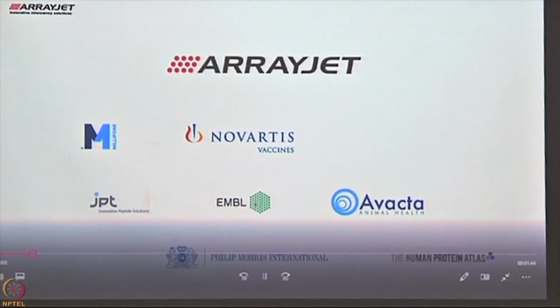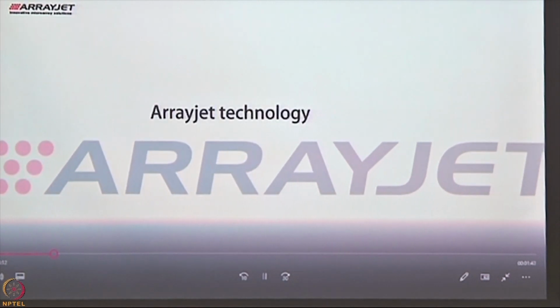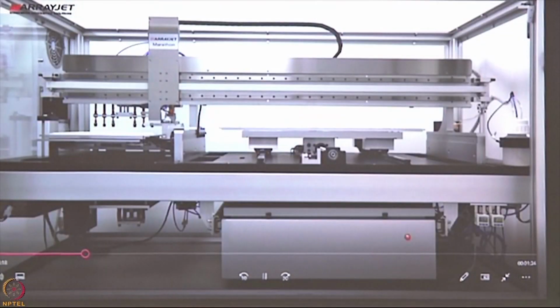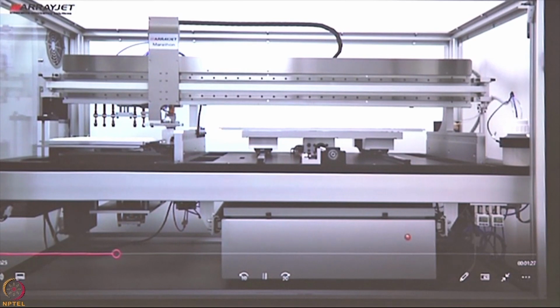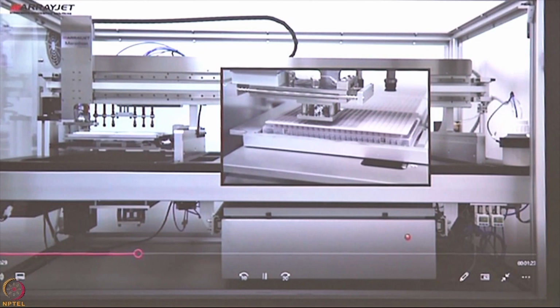So this is how the technology really works, how the printing is done. You can see this is the platform. You've got a tray of 25 slides, and that's how it moves. Each time it moves, it prints 12 samples on one slide, second slide, third slide, fourth slide, till 25 slides in an on-the-fly motion.